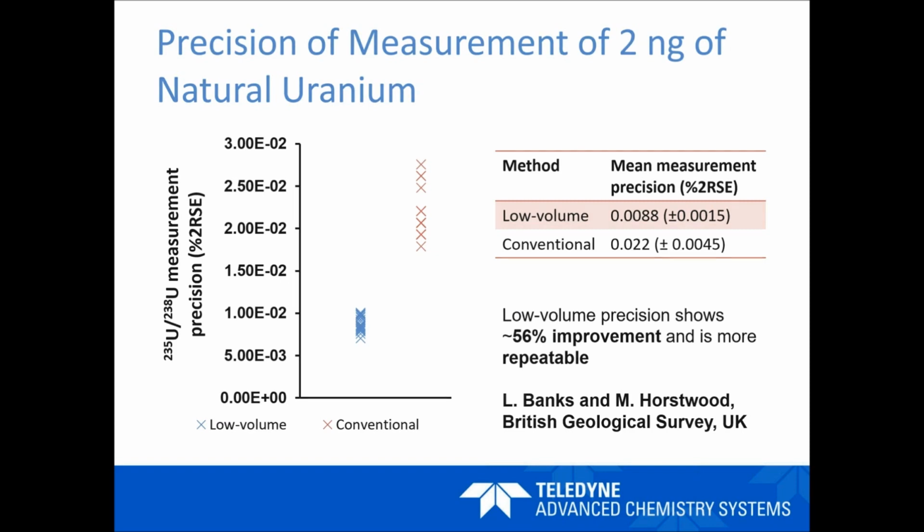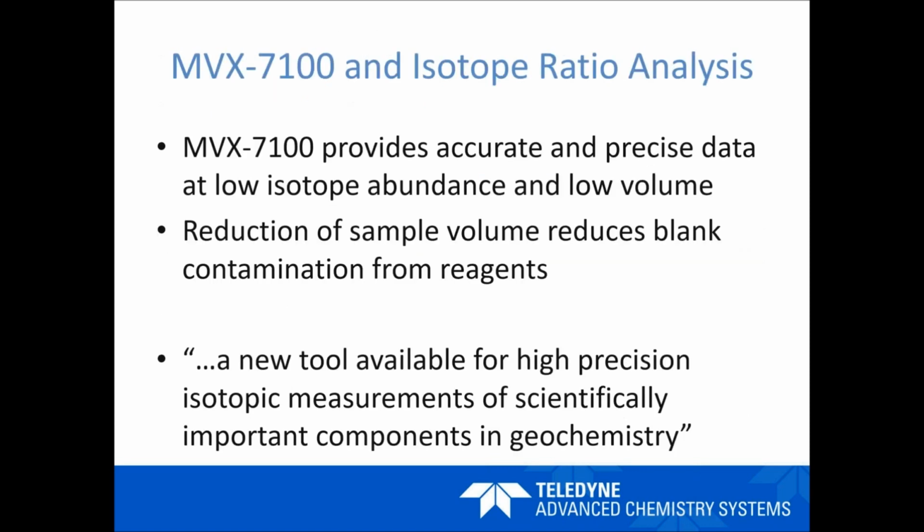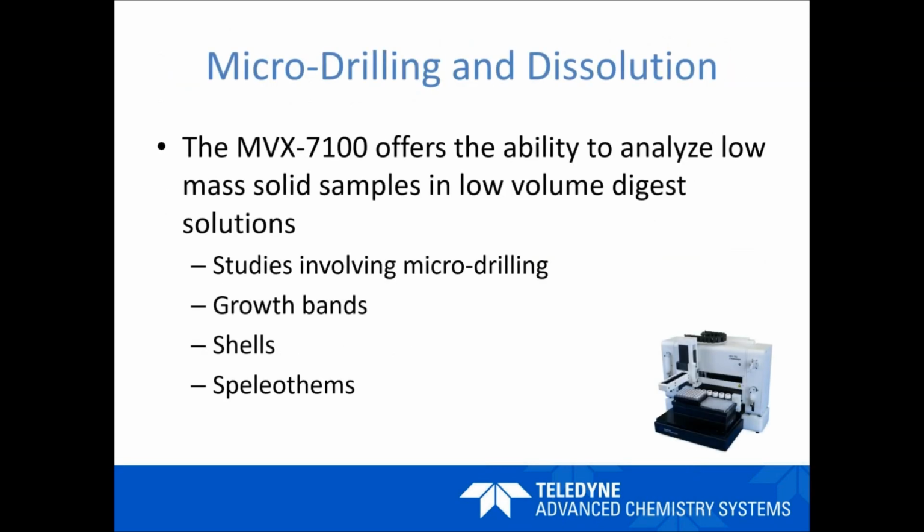Sorry, this is essentially a conclusion summary to what I've just said there. Outside of multi-collector work and geochronology, but staying in geology, you might be looking at samples where you might have growth bands. You might be looking at things like shells or speleothems, whereby you're looking at spatial resolution of a sample. That might be your overall interest.